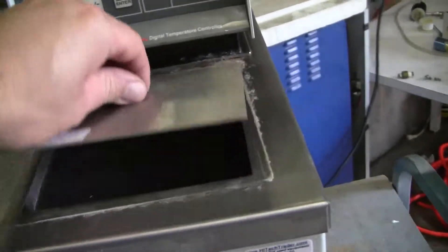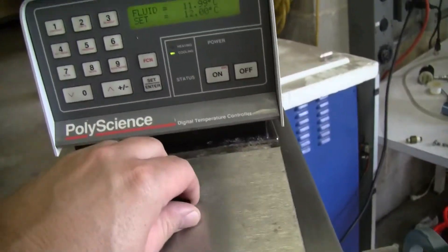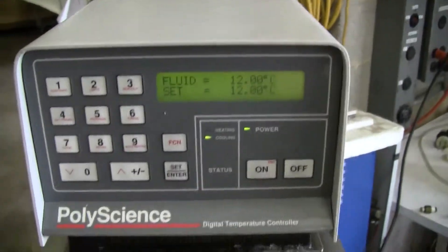As you can see, it's a very hot day in the warehouse. However, it is cooling down quite nicely to that set point of 12 degrees.